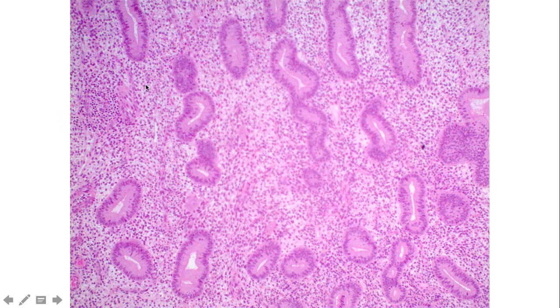Here's just a close-up of that. We can see the uterine glands. These uterine glands then open up to the lumen, and this would all kind of represent the mucosa layer with the lamina propria. This may resemble actually some lymphatic follicle that's existing within the uterus.